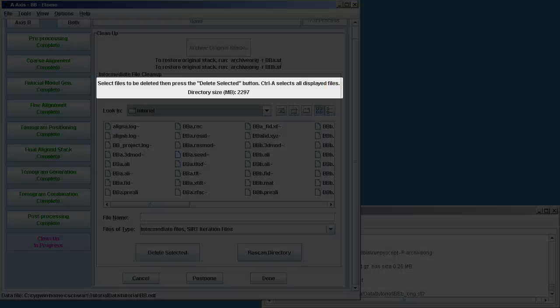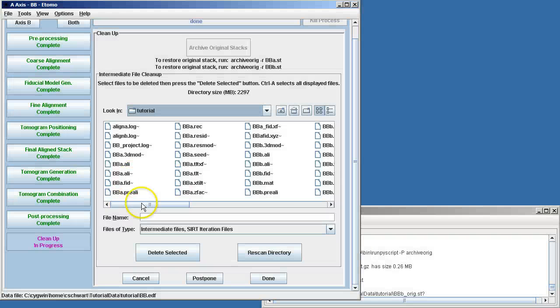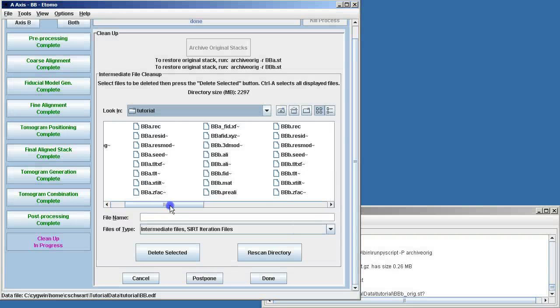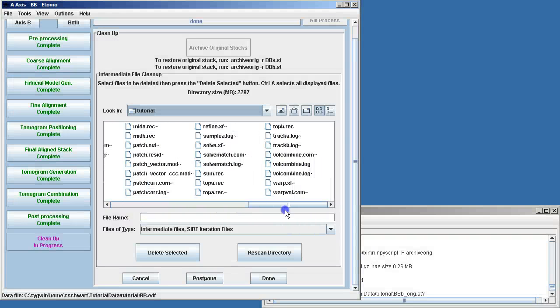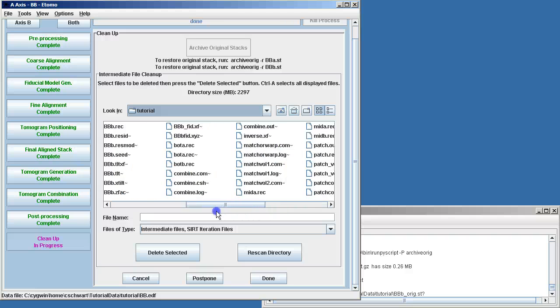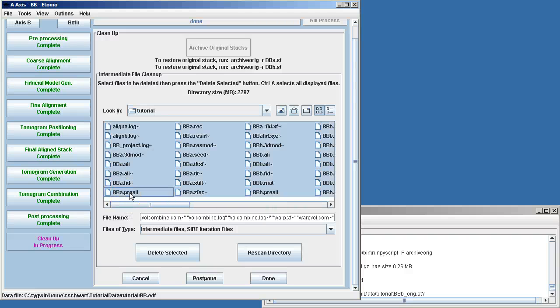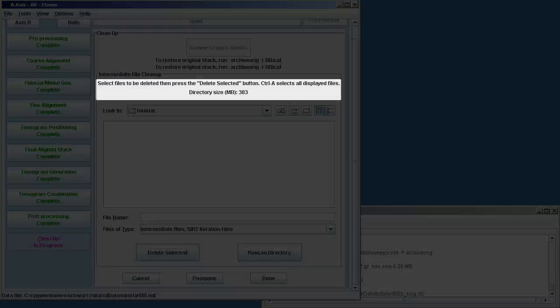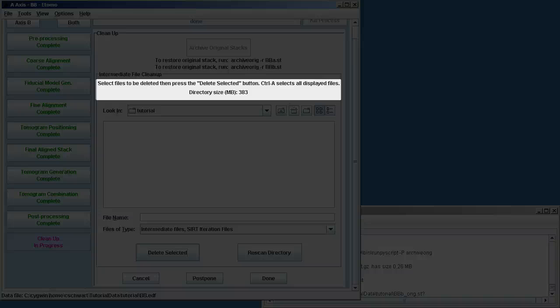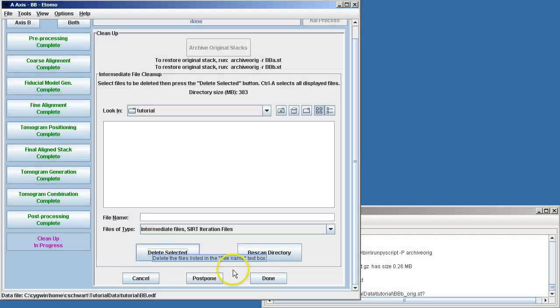Now we can see that our directory is about 2.2 gigs, and so we can delete all of these intermediate files that we no longer need. These are all sorts of backup files and previous version files and files that are easy to make. So we can delete all of them, and you'll see that now we're down to 383 megabytes. This is important when you want to archive all your data.